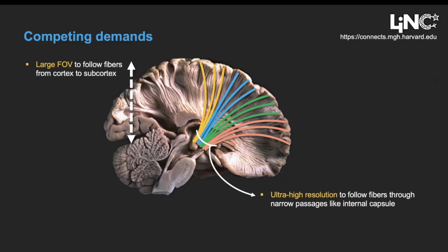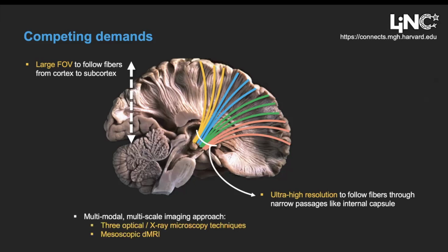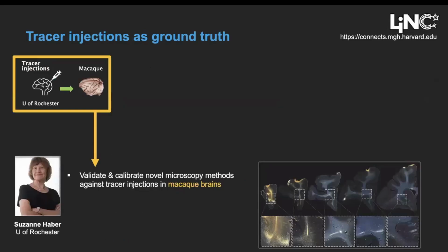And so because of that, we approach this problem with a multimodal, multi-scale imaging approach that involves 3 different optical and X-ray microscopy techniques, as well as the mesoscopic diffusion MRI to link it back to in vivo neuroimaging and to clinical applications.